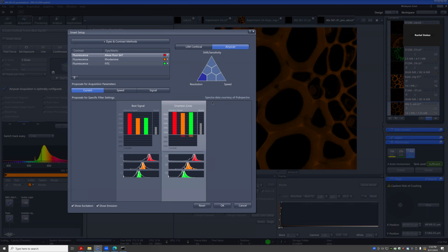Based on how you set the frequency or interval, do they process the image every time for each time point? No, you'll get a final image where the time points will be like a slider.